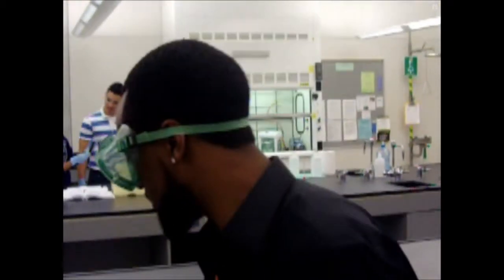Now, don't be impatient with this. The key thing to this test is patience. If you increase this to somewhere around 60 watts, the melting is going to happen very quickly, and you're not going to have a good range of where your melting started and when it became completely liquid. So your range is going to be off. So if you want to get an accurate range, you have to do this very slightly. So patience is a virtue.